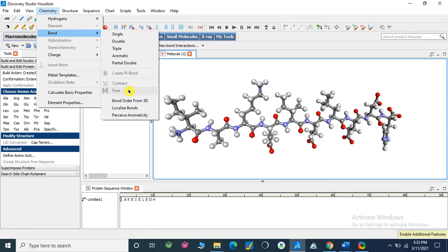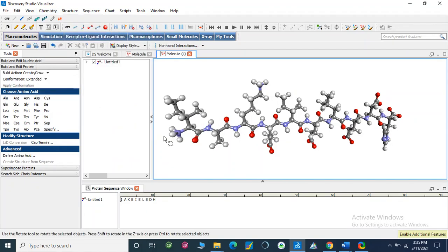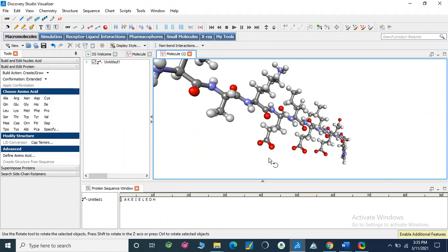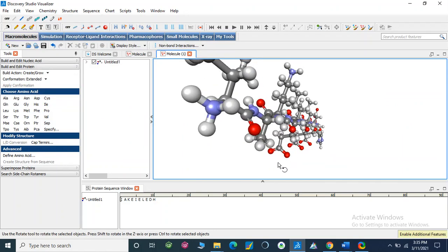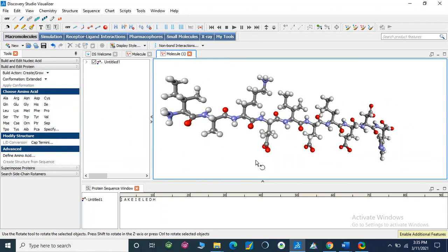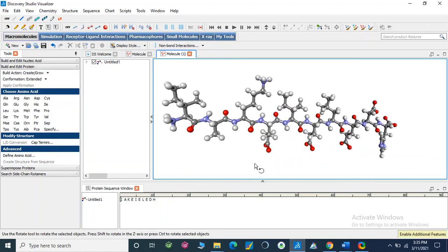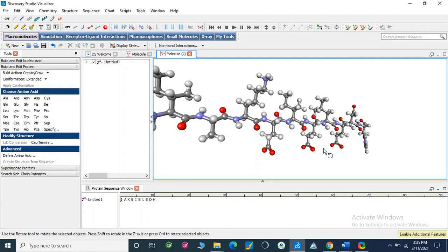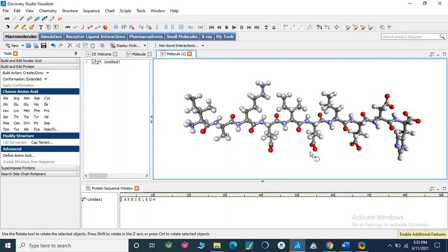Now we know that this is our first amino acid and this is the amino group. Here is our last amino acid with oxygen. Now this carbon will make a bond with this nitrogen of the amino group.